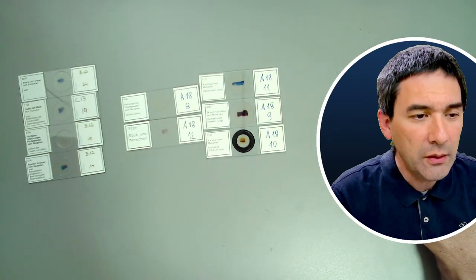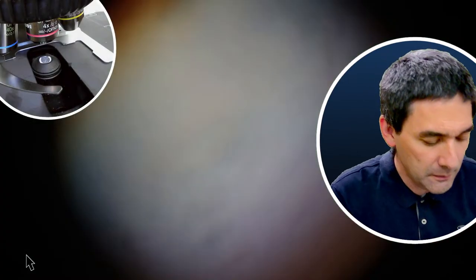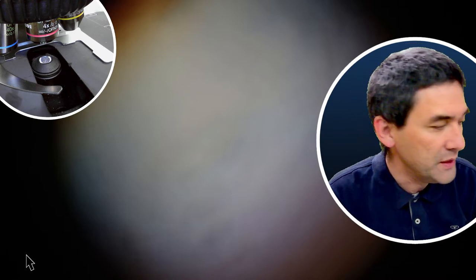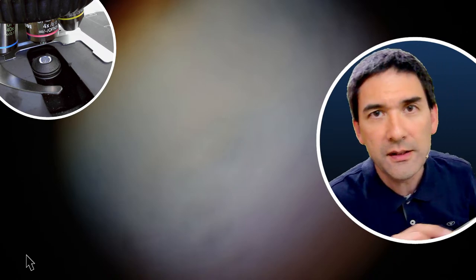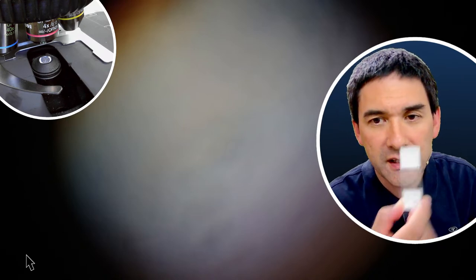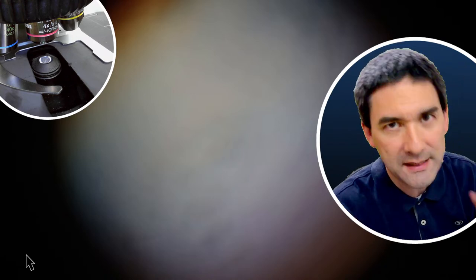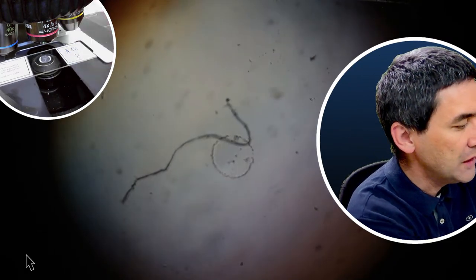So what I'm going to do now is jump over to the microscope view, and I'm going to show you now the worst slide, okay? Because this one slide is quite difficult, but it's still good to illustrate an important concept. These are epithelial cells from the inside of the mouth. It's a commercial permanent slide, but it illustrates a little bit the problem of refractive index. It's a pretty bad slide, but I will show you this here, and then also a better way.